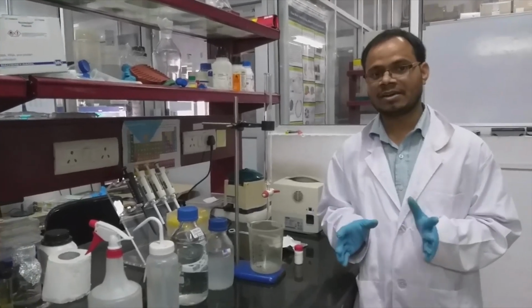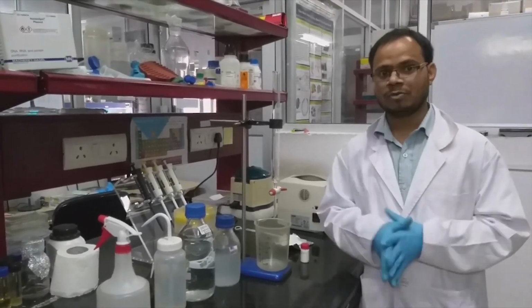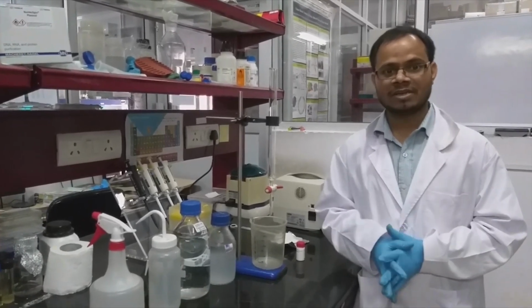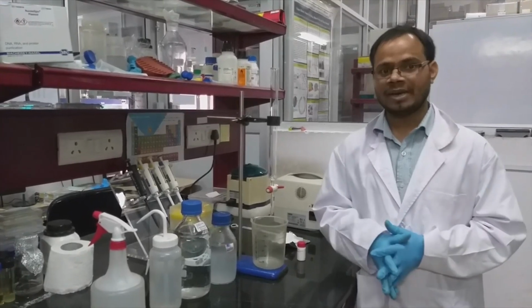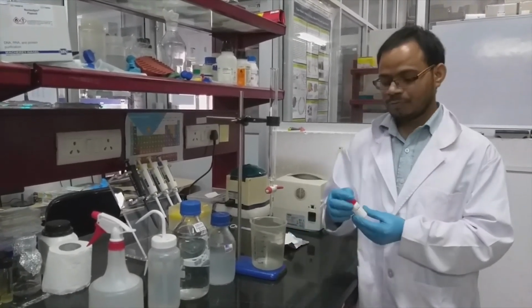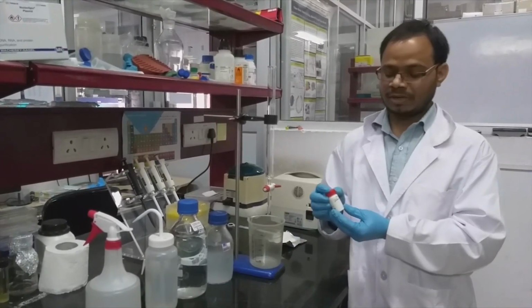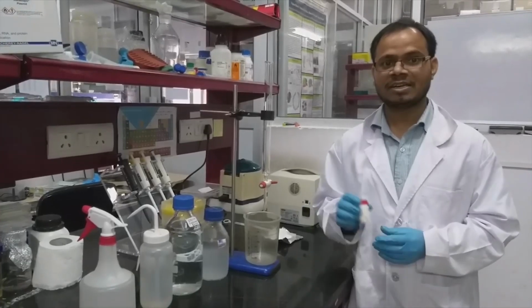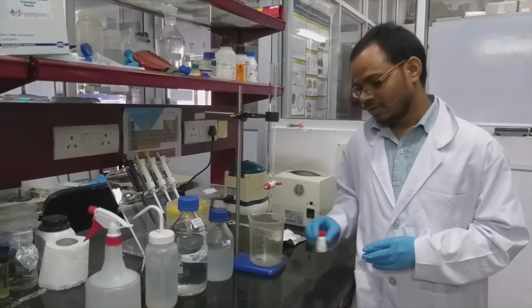This is highly cross-linked glucose molecules. Or we can use agarose, which is also cross-linked, or polyacrylamides. But in this video, we are showing Sephadex G75. This is the stationary phase we are using.